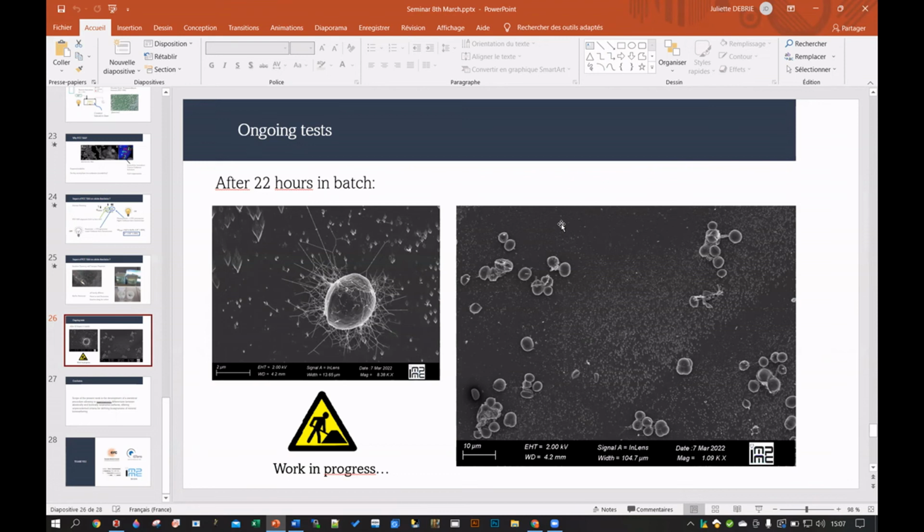This was without the calcite chip? No, both with the calcite chip. So far, the goal was just to stick a cell on the calcite chip, so that was really the only goal for now. I'm just curious, because it's a bit complex, and as Luca was mentioning, it won't be the same when you start flowing something through that. I'm curious to see how the pH varies, because at some point it can go too high, and whether calcite dissolution or some precipitation is happening. You should get some equilibrium at some point with the calcite.